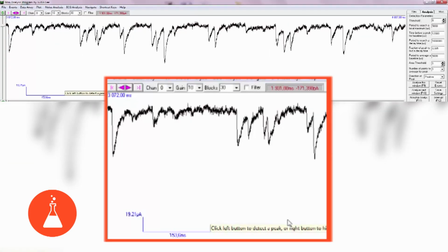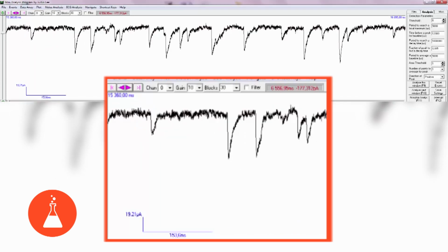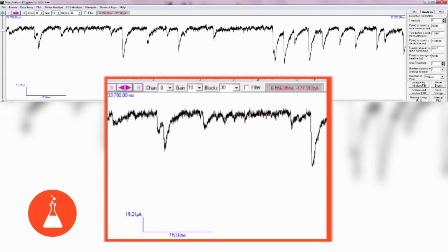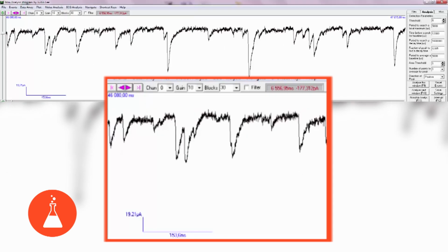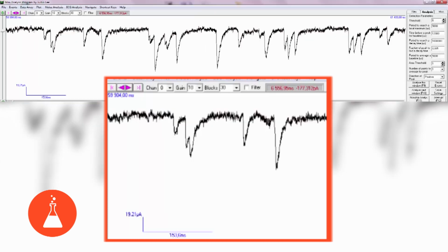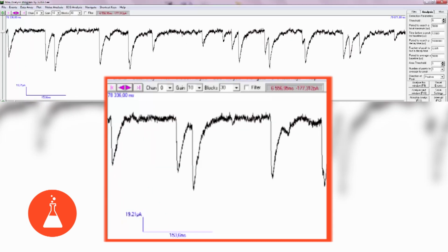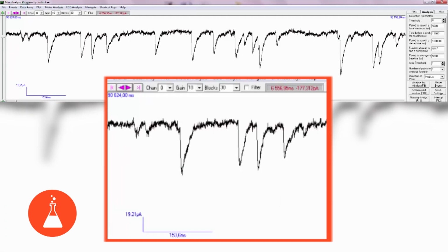We see a recording of spontaneous GABA-A currents over time passing here. These currents have a variable amplitude on the order of tens of picoamps. This amplitude is variable because the number of GABA-A synapses active at the same time is not always the same. In effect, GABA-A synaptic currents result from a simultaneous activation of multiple postsynaptic GABA-A channels by a GABA release from the axonal terminals afferent to the neurons being recorded.